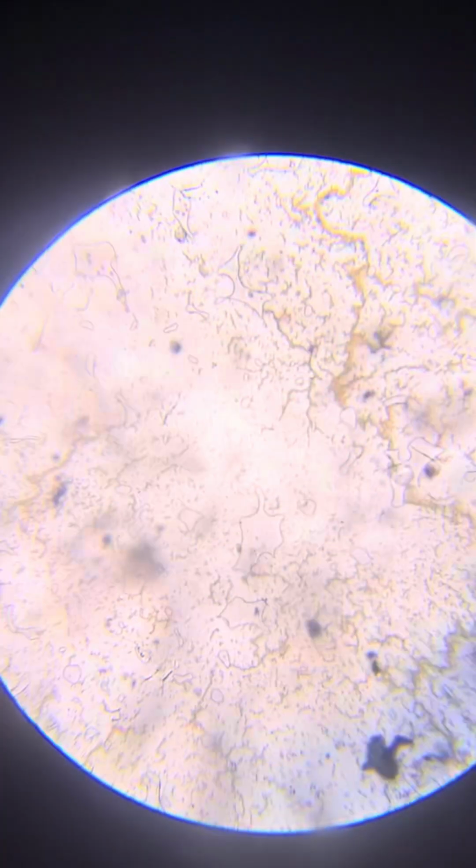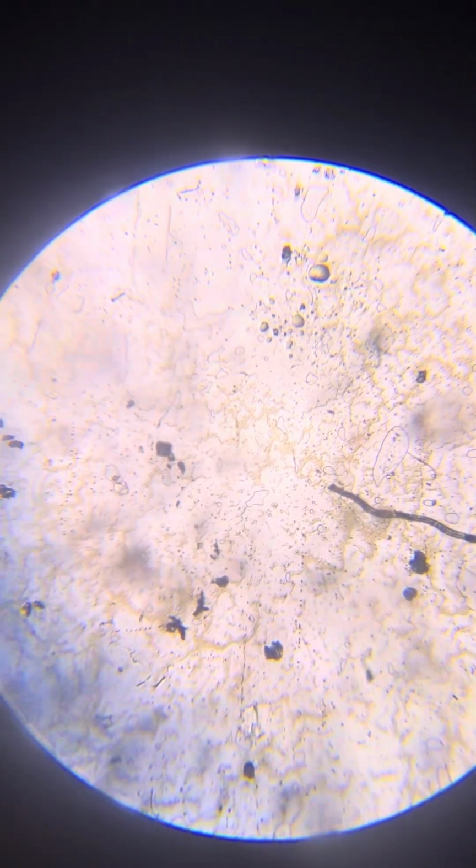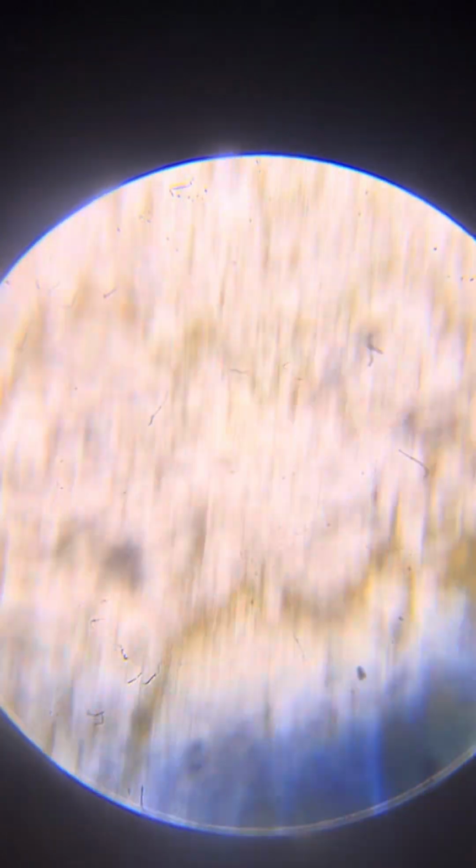So this was kept sealed in a container that actually does not contain a lot of oil or wax. Because at the time I didn't understand the importance of those things.